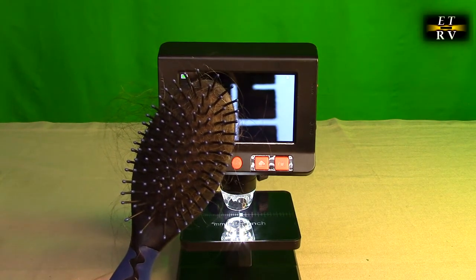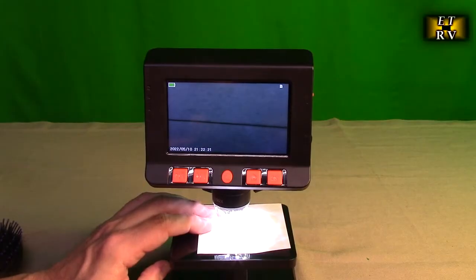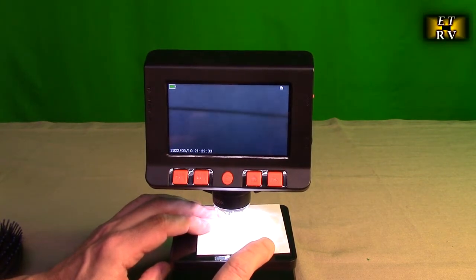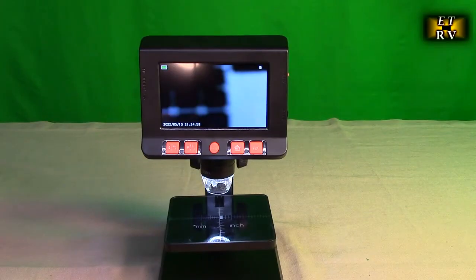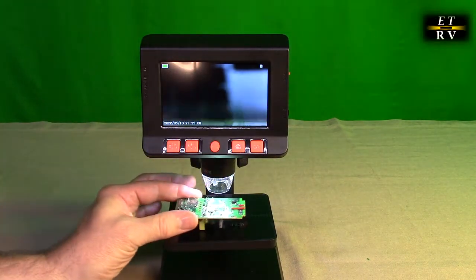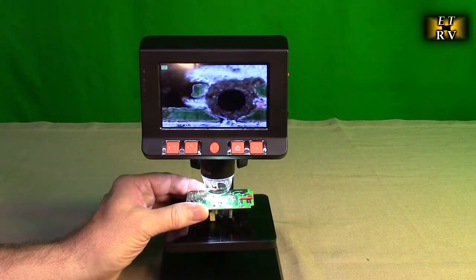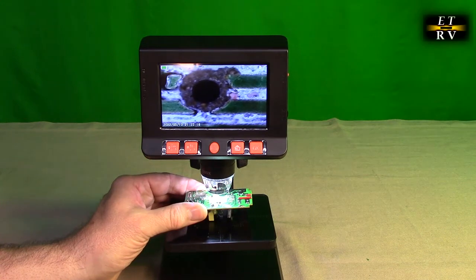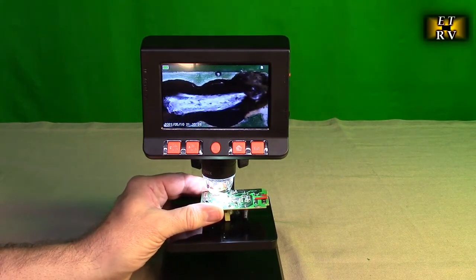Here's my wife's comb — I'm going to take some hairs and see what I can zoom in on. To help see the really thin hair I have a post-it note on there with the hair laying on it so I can see more contrast. There is the hair — I could increase the zoom to get even more resolution. Another interesting application: if you're doing circuitry and have a circuit board with an issue with the solder connections, you can use this to really blow up the solder connections and you can see right there it's missing some solder that you can't see with your eye.